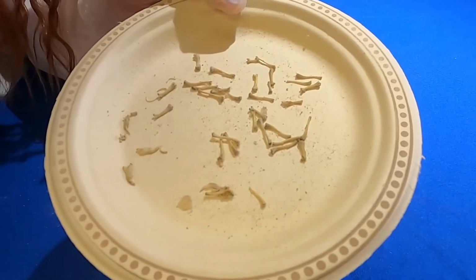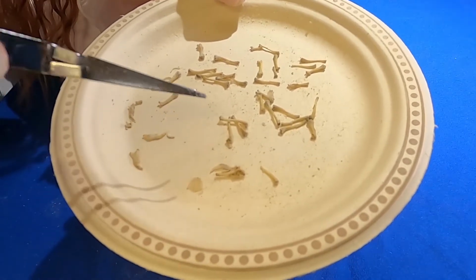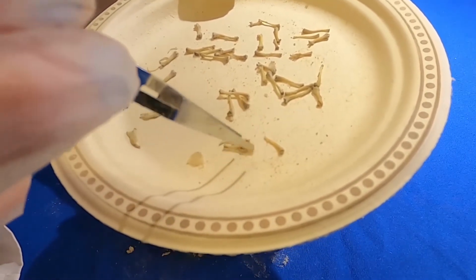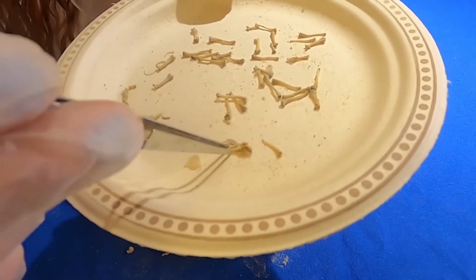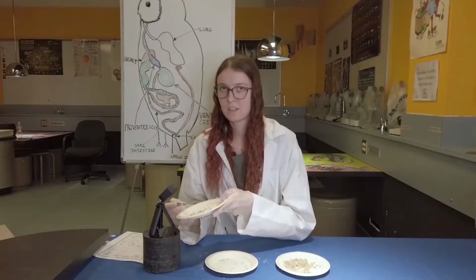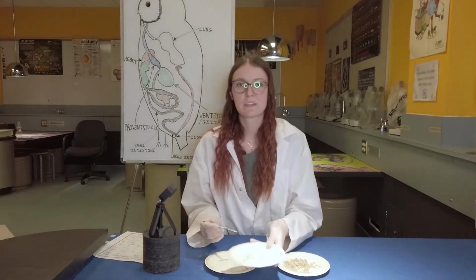So looking at the other plate here that I have of all of the other bones that I found in our other pellets, some of the bigger, cooler things that I found is a mandible jaw with the bottom half as well, which is kind of rare to find because they can just break really easily, and I actually have already broken this one a little bit. But this is just the bottom part of it, and then this is the top half of its jaw. So as you can see, we have found a ton of different kinds of bones from these pellets.